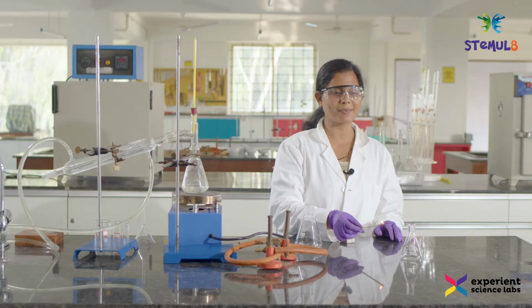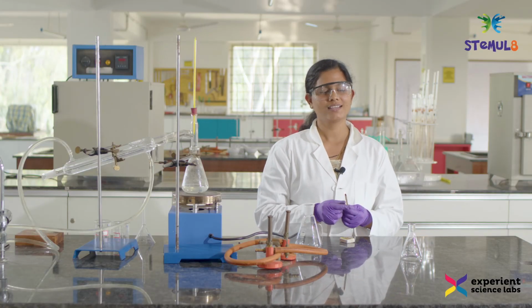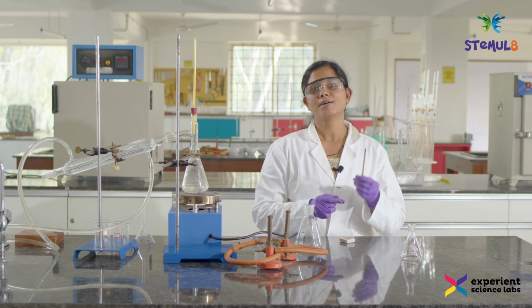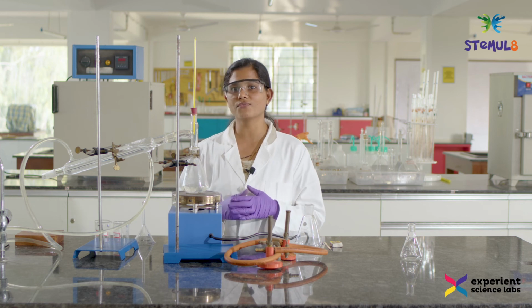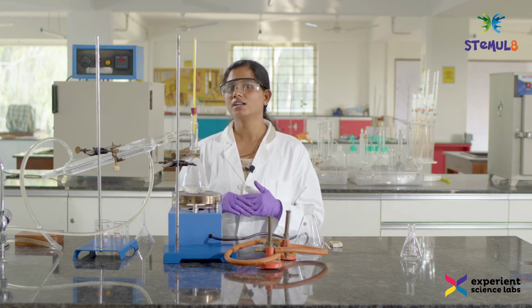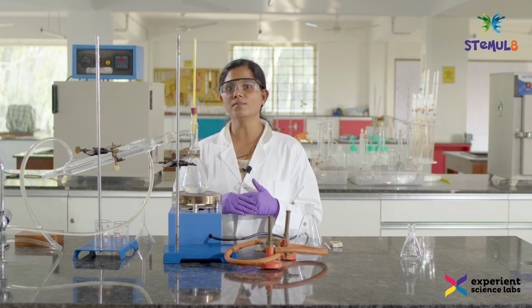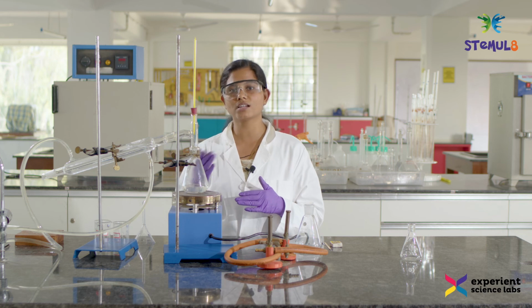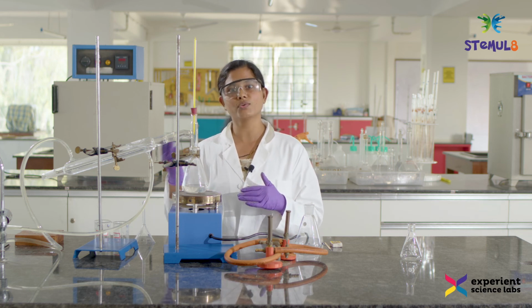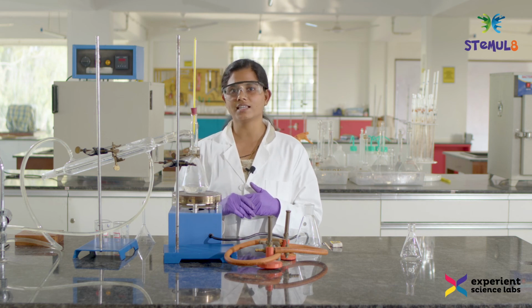Wow, this was amazing. Can you all just comment on what happened? If you all know the answer, let me know in the comment section. To conclude, I have shown you the fractional distillation procedure, the distillation procedure which was used to separate ethanol from water. So this particular distillation process, or other complex distillation processes, are used in various applications and in large-scale industries.